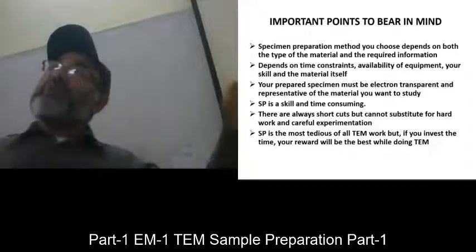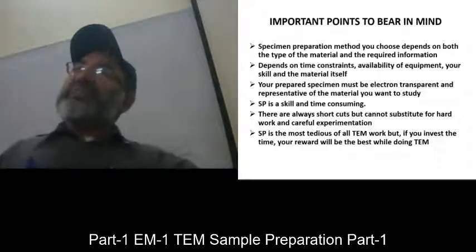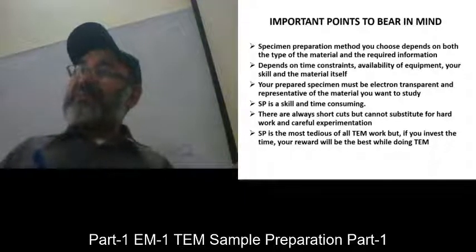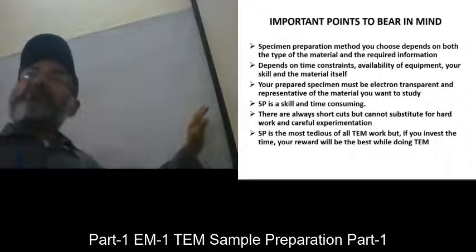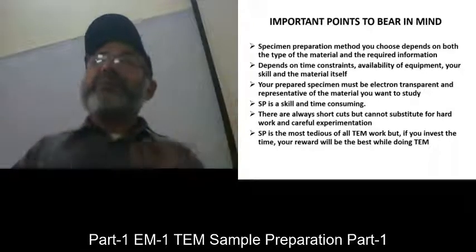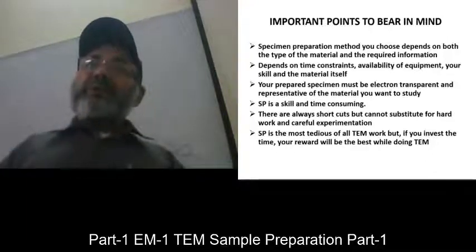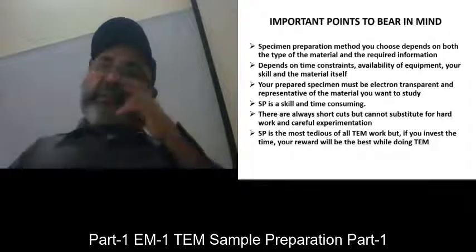And that is why you need to completely make the edge of the crystal free of any superposition by the glass, the glassy phase, right? So when it is at the edge, then there is a chance that you will get a composition closer to that. But remember, a single technique cannot be trusted. You must support your information by other techniques, the side techniques.